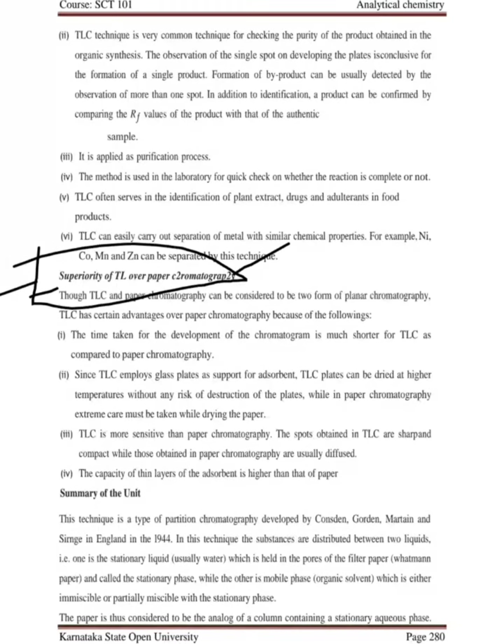The development of the chromatogram and the spotting are much faster compared to paper chromatography. Next, TLC plates can be dried at high temperature without any risk.